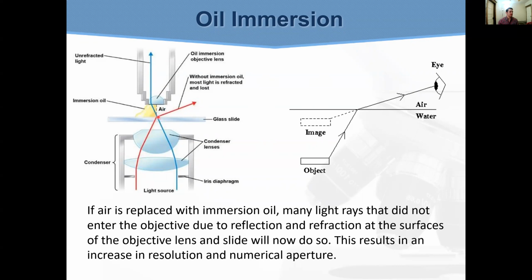If you look at this, this line here describes this. The light from the light source down here leaves the glass slide. It becomes refracted, so it's missing this lens. So you're not seeing any of that light. This is a problem. So how do you deal with that?